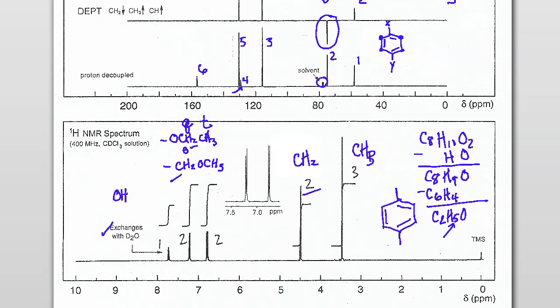Whereas down here, you would have a singlet for the CH2 and a singlet for the CH3, and that's because the oxygen disrupts them. And in addition to that, in the top example, the CH3 would be much further upfield. It would be more shielded because it's not in direct contact with the oxygen. Whereas we look here, 3.5 and 4.5 are the approximate ppms.